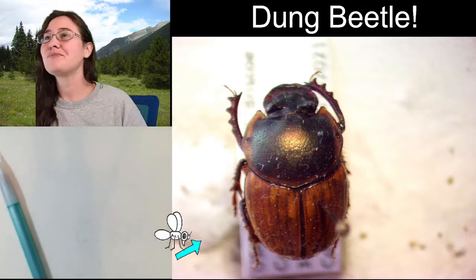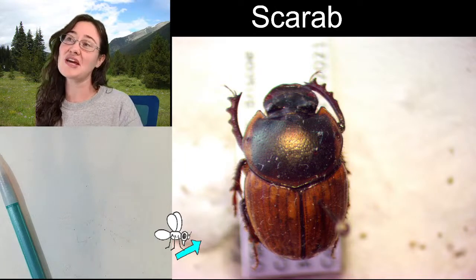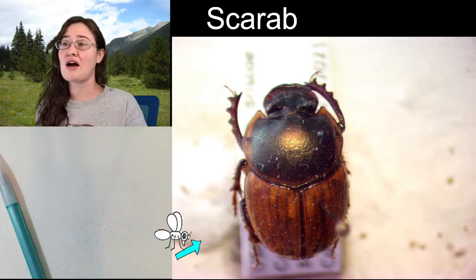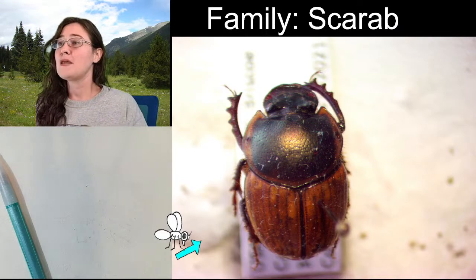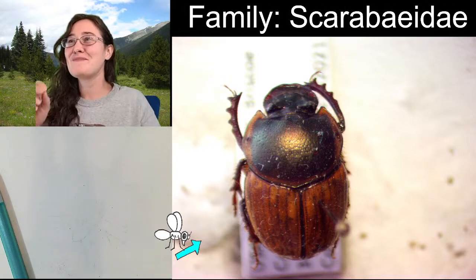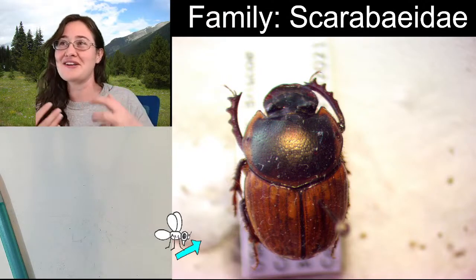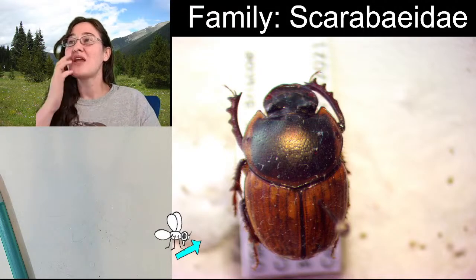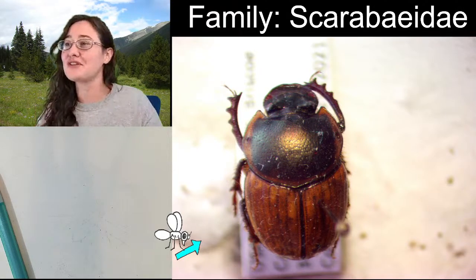Alright, so dung beetles are actually a type of scarab beetle. Scarabs are a very large family of beetles. So if we were gonna say family, you would have Scarabaeidae. And I love Scarabaeidae because you get three vowels in a row, and I've always thought it was one of those fun names to say and to write. Look at all those vowels. So, all scarabs are in the family Scarabaeidae, and so are these beautiful little dung beetles here.